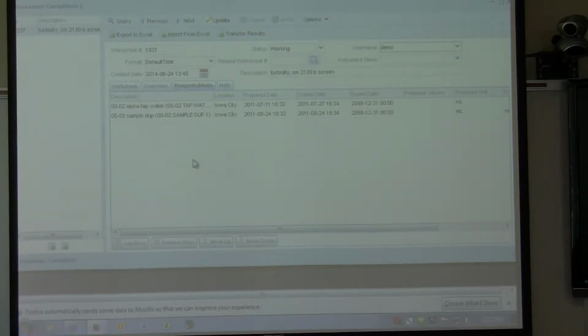But the question on the reagent media: obviously not QC lookup. You would not be able to add a reagent media on the low QC template, sorry. That is a feature I'm working on programming. So when you pick your template on the builder screen, I'm going to program it so it pulls in any media you set up from your test definition too. So you won't even have to do this part on the screen because they'll already be there. Will that be in place before we go live with this new completion tool? It'll all come in together.